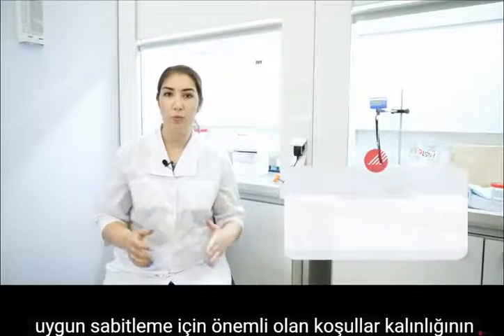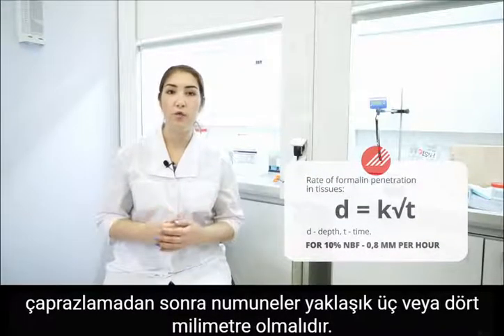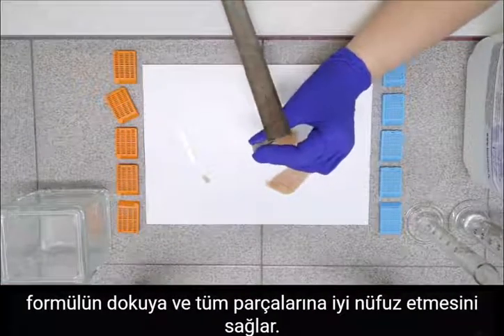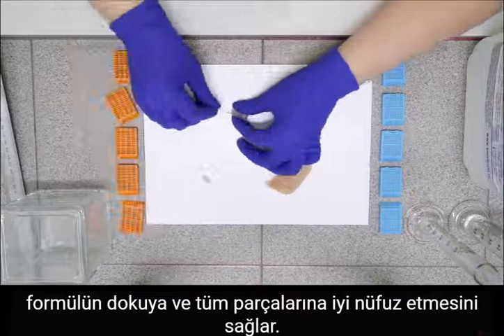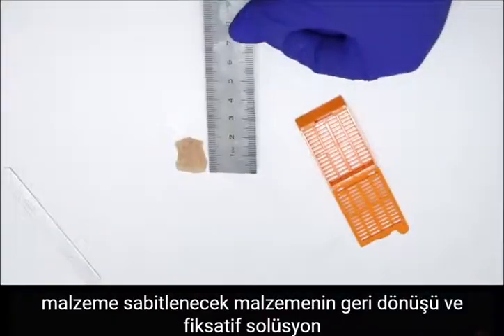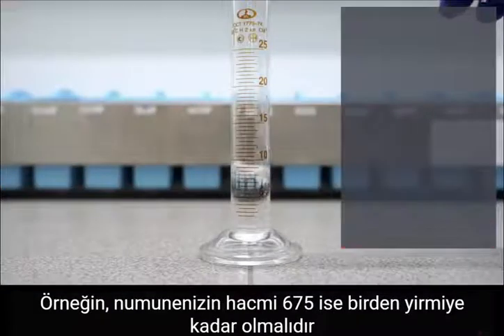which are important for proper fixation. The thickness of the samples after grossing should be about 3 or 4 millimeters. It will provide the good penetration of formalin in the tissue, and all parts of the material will be fixed. The volume ratio of the material and fixative solution should be 1 to 20.